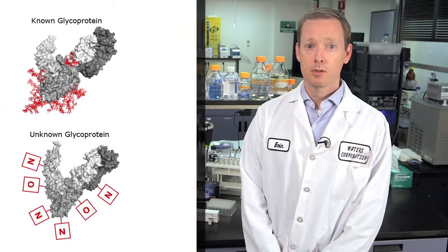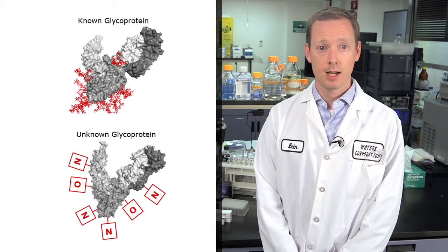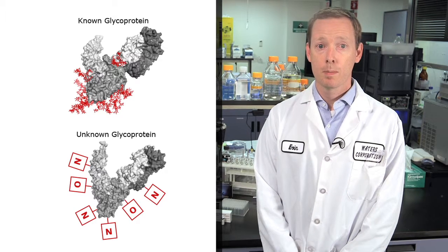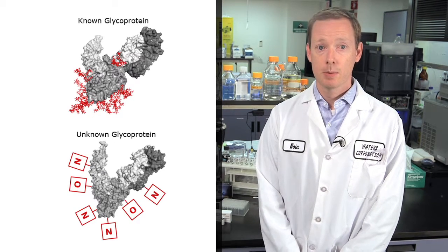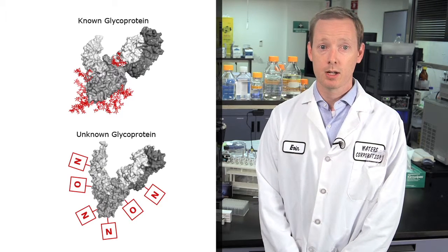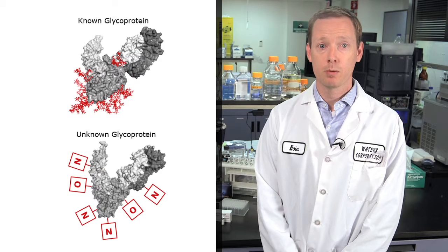The process of characterizing glycoproteins is a significant analytical challenge due to the complexity of N-linked glycosylated proteins, where post-translational modifications can potentially affect protein stability, half-life, biological function, and efficacy, to name a few critical product quality attributes. Unlike DNA or protein, glycans can form branch structures and don't follow a template, making them that much more difficult to characterize. When studying glycoproteins, there are several key factors that aid in understanding their ultimate biological function.